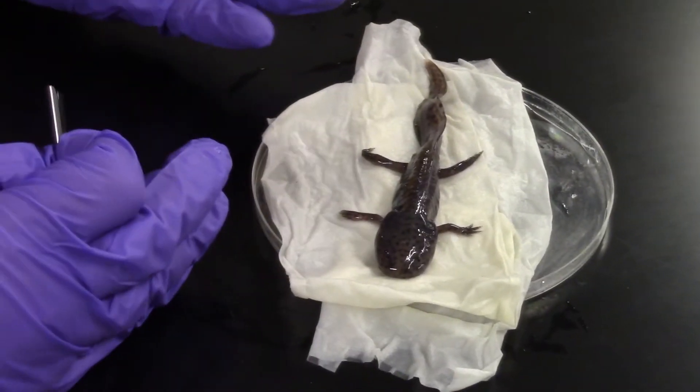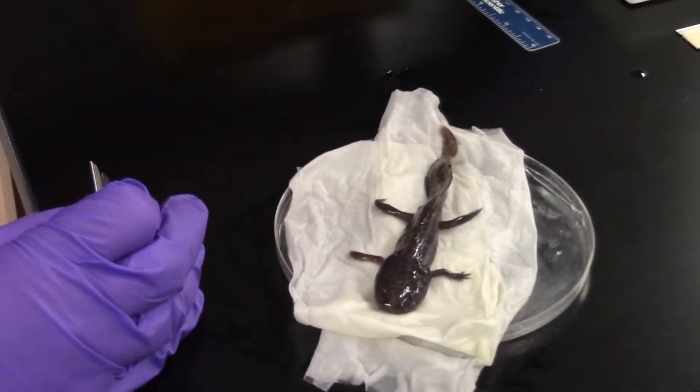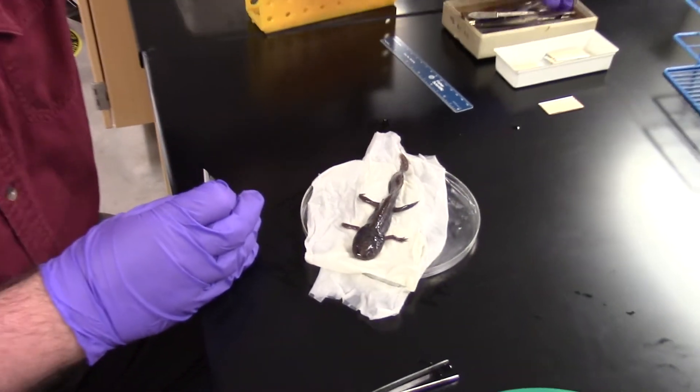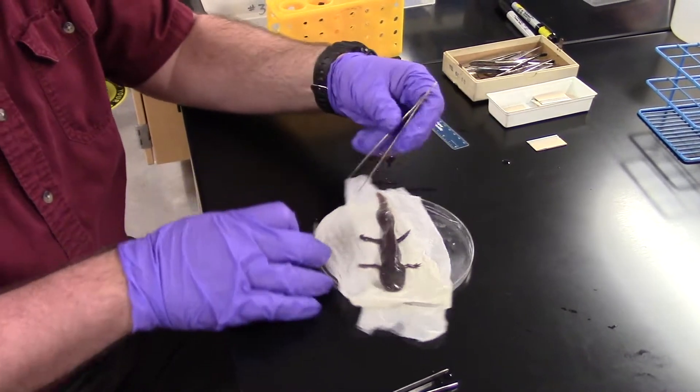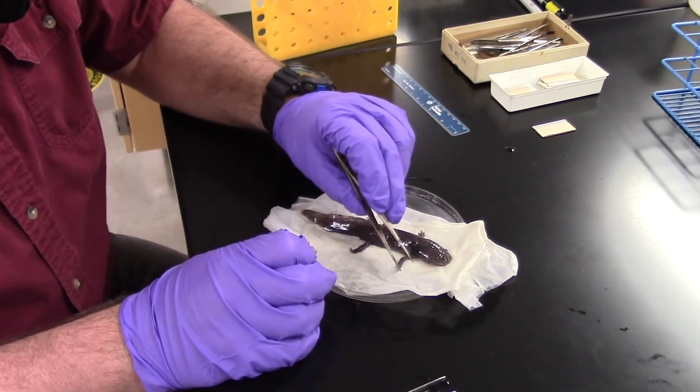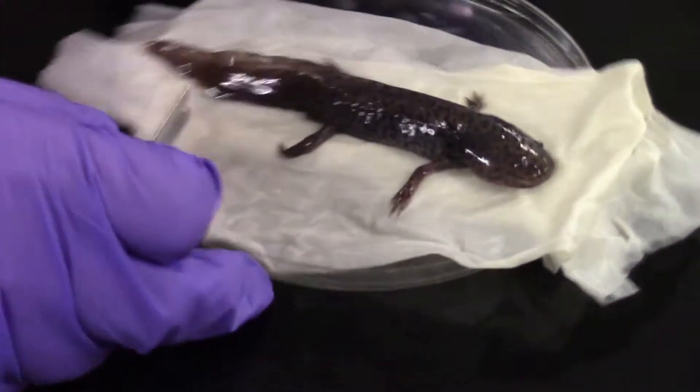So the animal has not moved since I picked it up. We know it's anesthetized. I can use some slightly sharper forceps to hold the limb in place. What I'm going to do is you can see all the little fingers right here, here's the wrist, here's the elbow. I'm just going to cut through the radius and ulna.